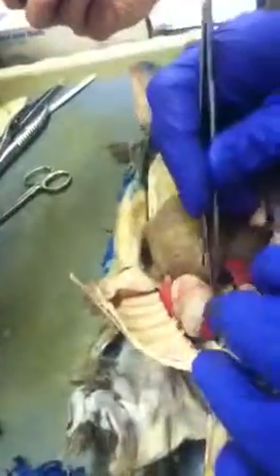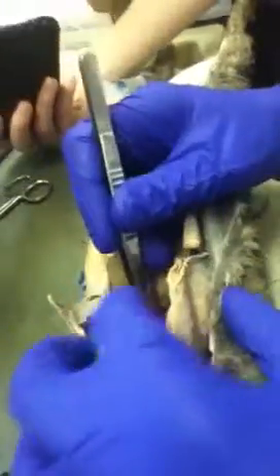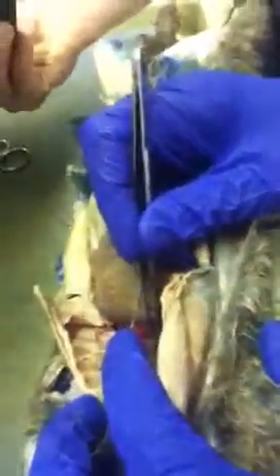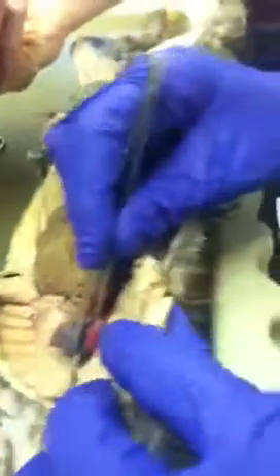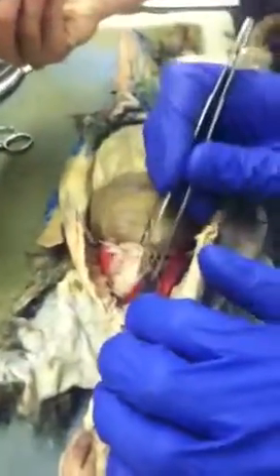Now, blood coming into the heart, excuse me, is coming in on the right side. Oh, yes. So here's a big old posterior vena cava coming in, and I'd like to have an anterior vena cava. Yep, there it is, bringing blood back from the head, bringing blood back from the body and from the liver into the right atrium and auricle, which are here.